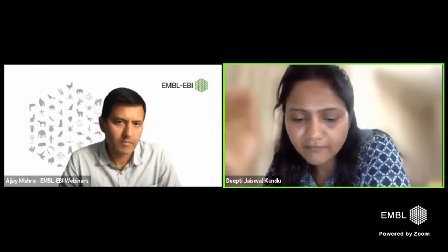Whatever is in GitHub, if users provide it when their dataset is public, and if the SDRF is in the correct format, it will appear with their dataset, which makes it really special because you can see all the very structured metadata information. So yes, you can find it from PRIDE Web as well.